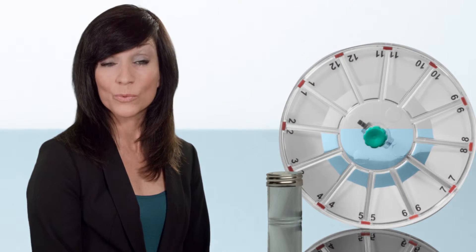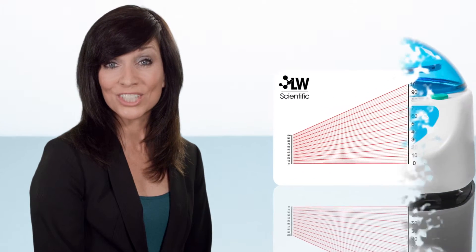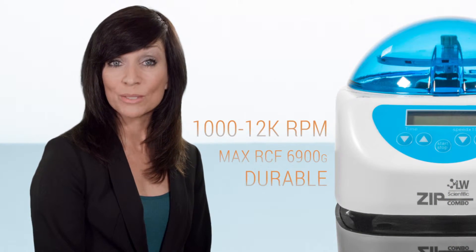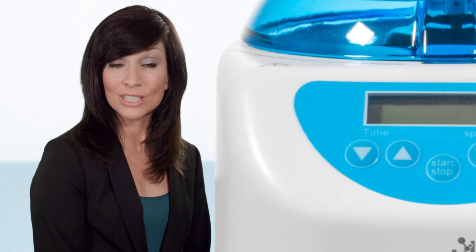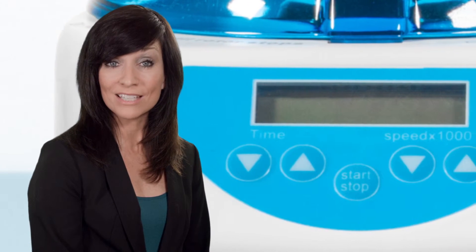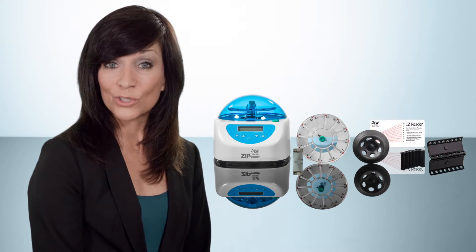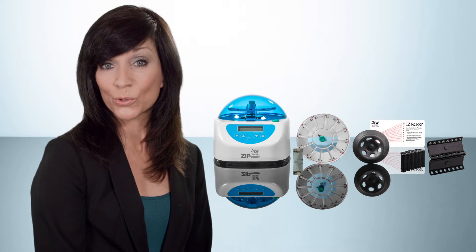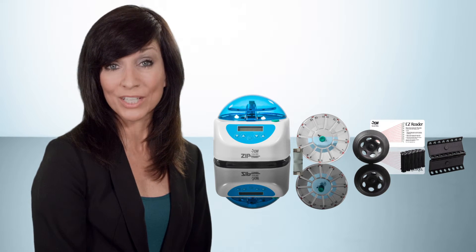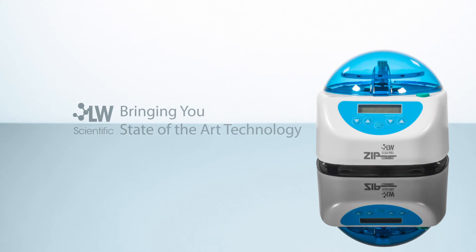Evaluating hematocrit tube samples is almost effortless with the included EZ card reader. The centrifuge itself is powered by a maintenance-free, brushless motor and features a digital display with programmable spin speeds and times for precise and repeatable testing. With these powerful options, this versatile and reliable centrifuge will quickly become an essential component to your laboratory's operations.